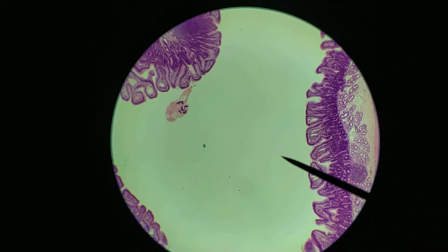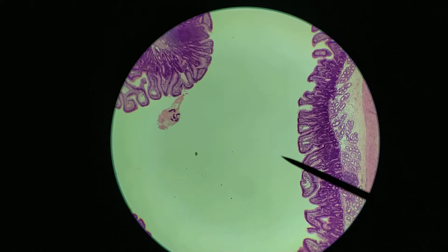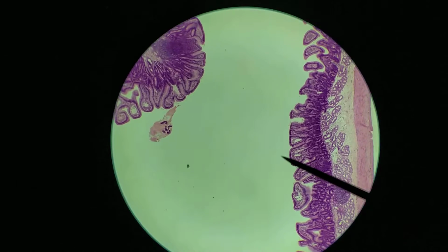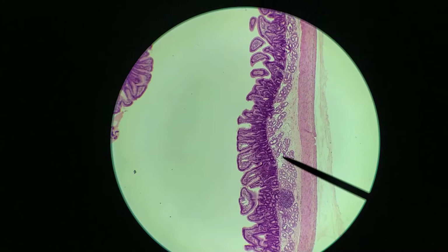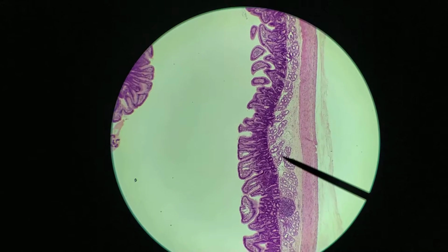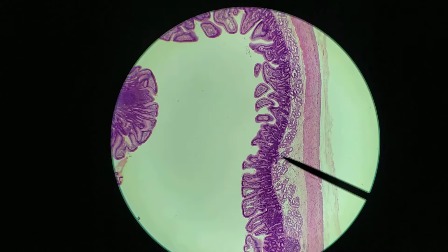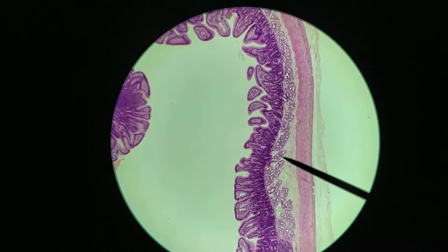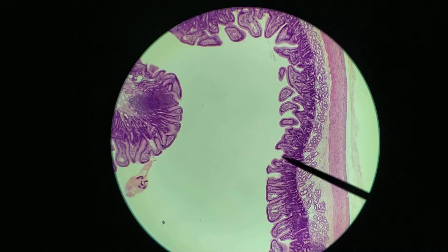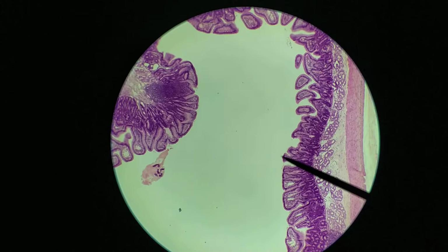The duodenum receives the chyme, the mashed up food from your stomach, and it's going to be coming through with an acidic pH from the stomach. And so what you need to have is some sort of protective mechanism, and that is being done right here by these glands. These are called Brunner's glands, okay, or the submucosal glands. So in these glands, you're producing a lot of alkaline mucus, which is going to be protecting the surface from the stomach acids that are coming through.